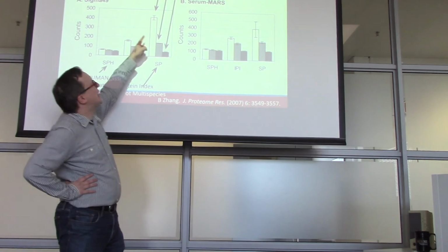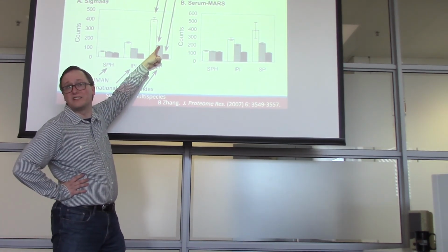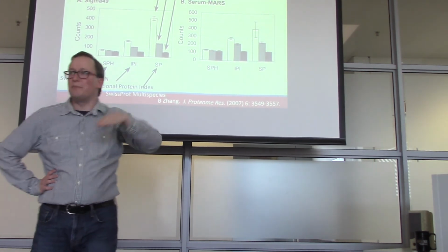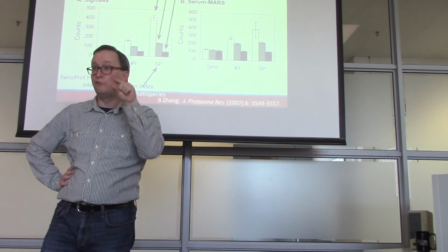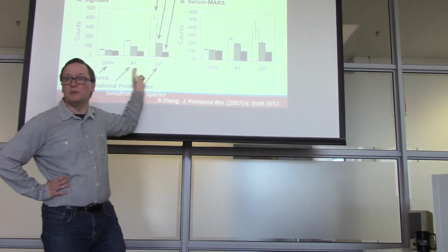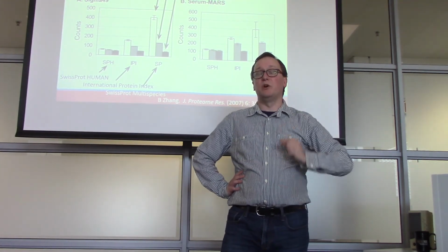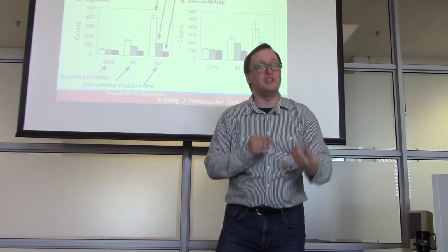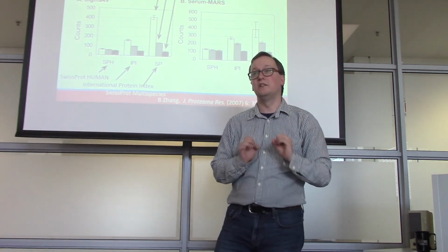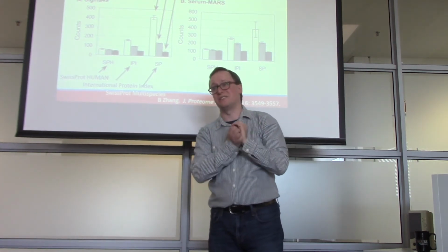So when we apply the grouping of indiscernibles, that number falls quite a lot, to 150 in this case. But once we apply parsimony on top of that, we get back down to this very small 49 protein list that we get from some of these other human databases that we worked with. So applying parsimony and being very careful about adding to your protein list to account for the peptides you see can do quite a lot to cut down the bulk of proteins to a list that's actually accurate.